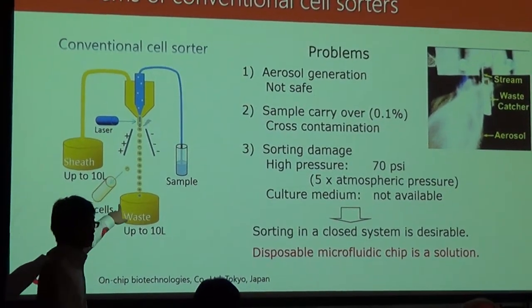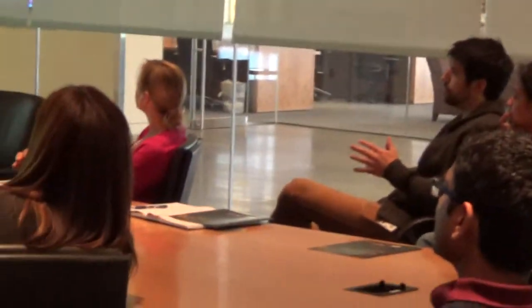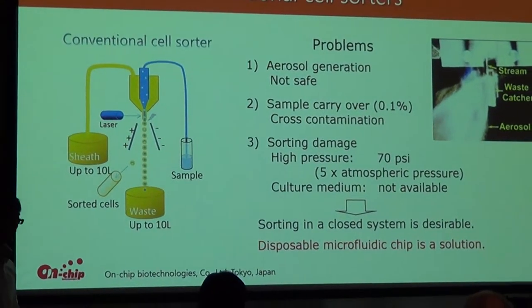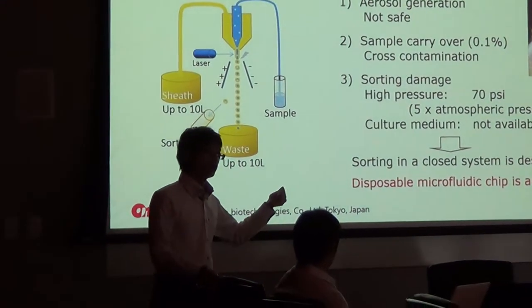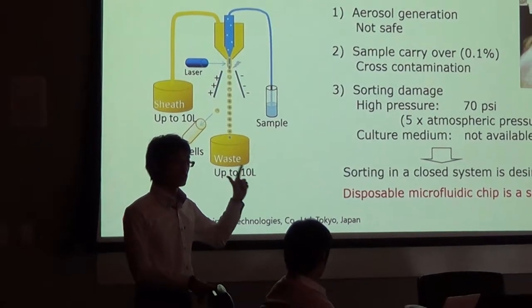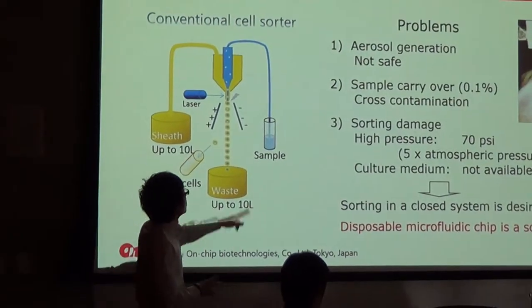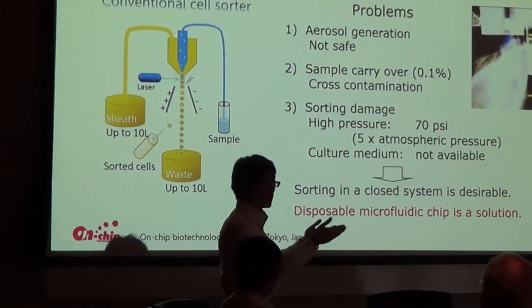When that comes out from the nozzle, we have to charge the cells, and also using ultrasound, we have to make it into small, tiny liquid droplets. Then all the charged cells would be either attracted or repelled using the plates. Then finally, these cells that are flying at such a high speed are collected in the pocket. That's really damaging. So they've got the whole ultrasound process, charging process, and also the collecting process that's really damaging to the cells.